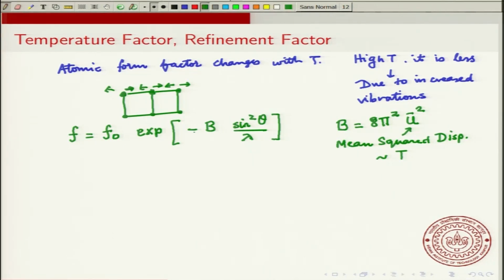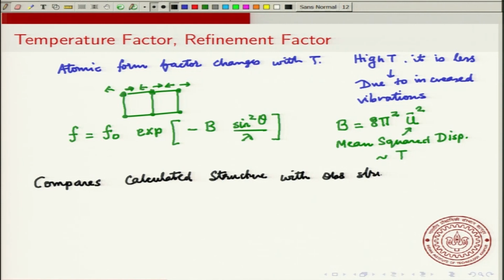And as the name suggests, it compares the calculated structure with the observed structure. Okay. I won't spend too much time on this.